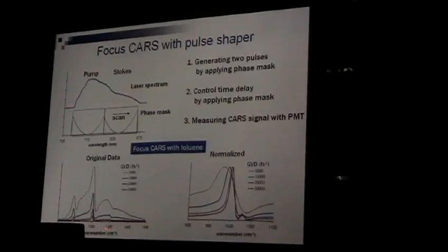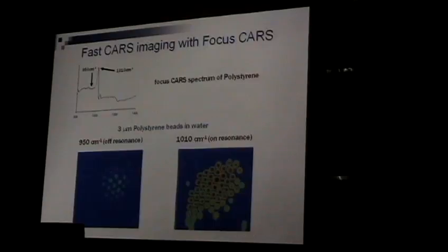Again, this is not single shot. Here, the x-axis is basically me scanning this phase point by point and detecting everything with the PMT. So this is like single picosecond CARS, but the difference is here I don't have to tweak the laser or change the temperature.